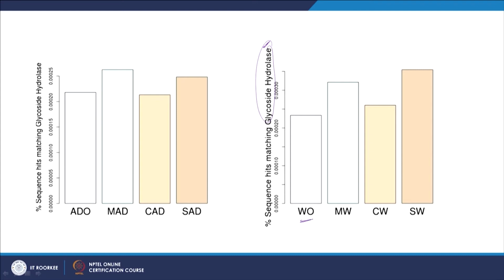For example, this sample has been incubated for more than 200 days. It was taken from a wetland. It's the original sample, as in original for the batch assay. And then it was exposed to microcrystalline cellulose, cationic nanocellulose, and sulfuric acid reduced anionic nanocellulose. And I can see how, after a period of time, which is 4 weeks, the glycoside hydrolase have changed from the initial inocula over time.